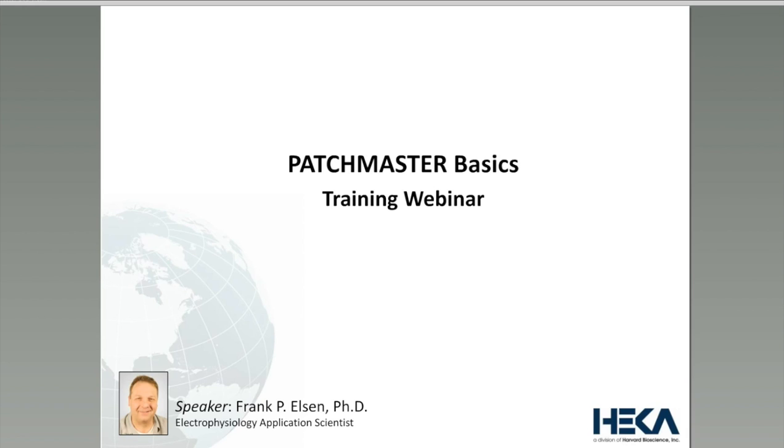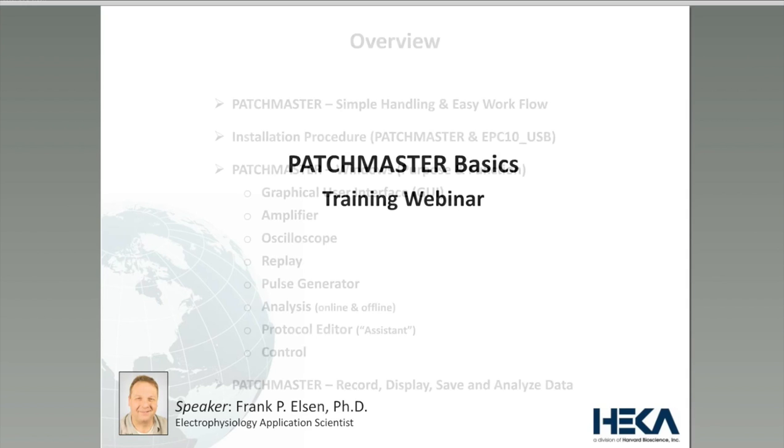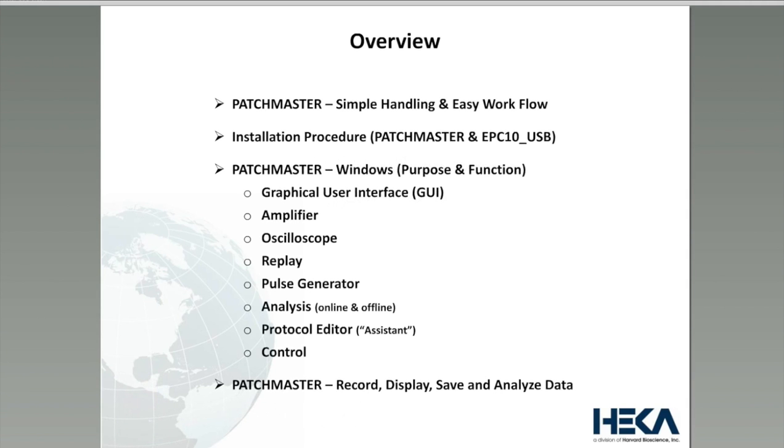But to practice, you could download the software later from our website for free and install it and run it on your computer. To do that, you do not need any dongle or any hardware installed. You can run it simply in demo mode and you can play around with it a little bit. And while you're at it, I would also recommend to download the PATCHMASTER manual. There's lots of useful information in it. With that, I would like to get started.